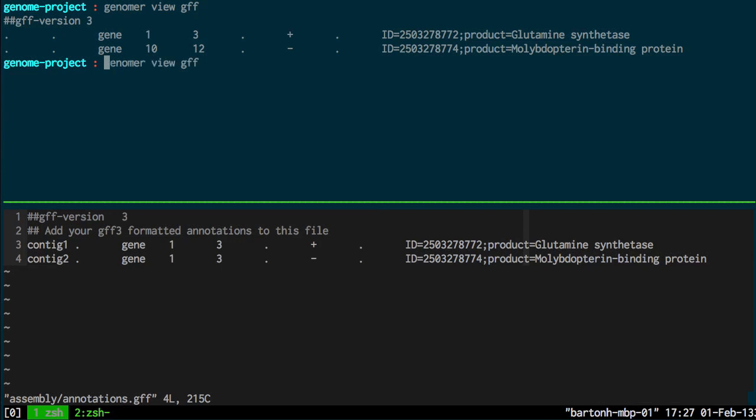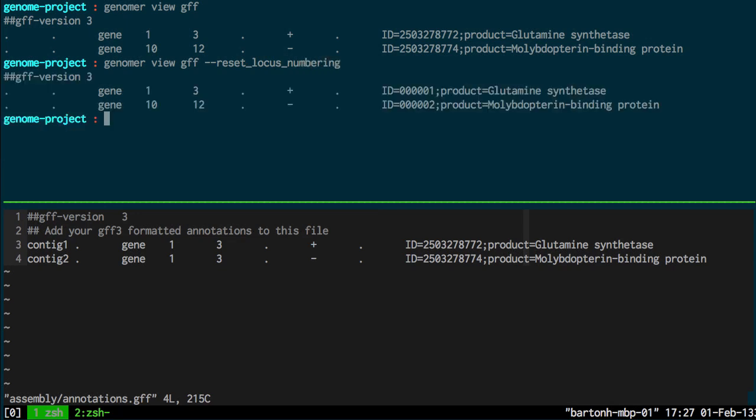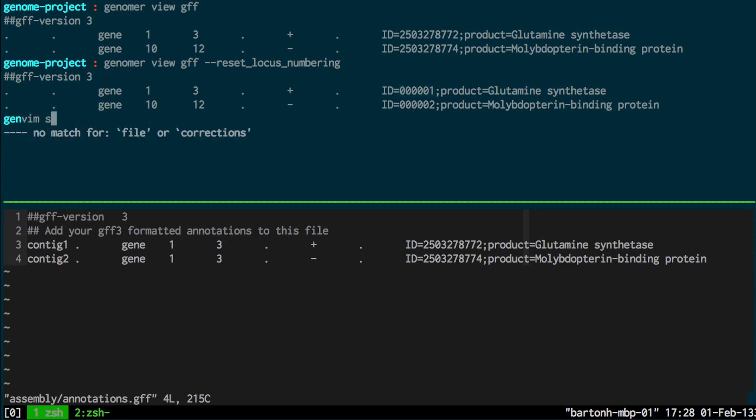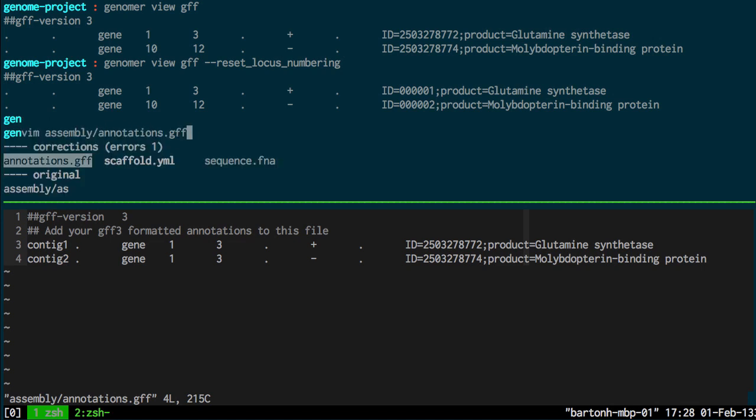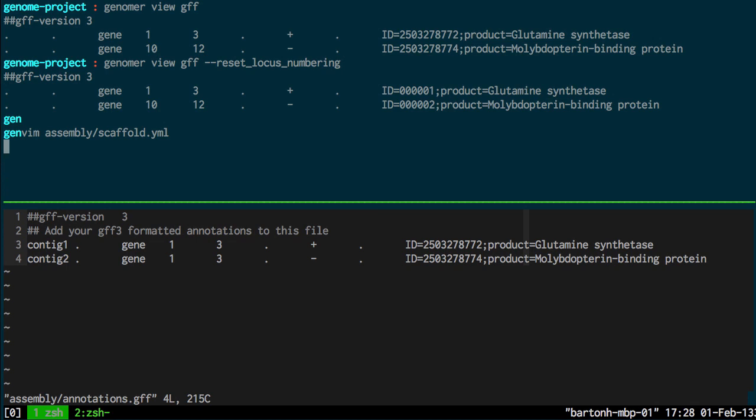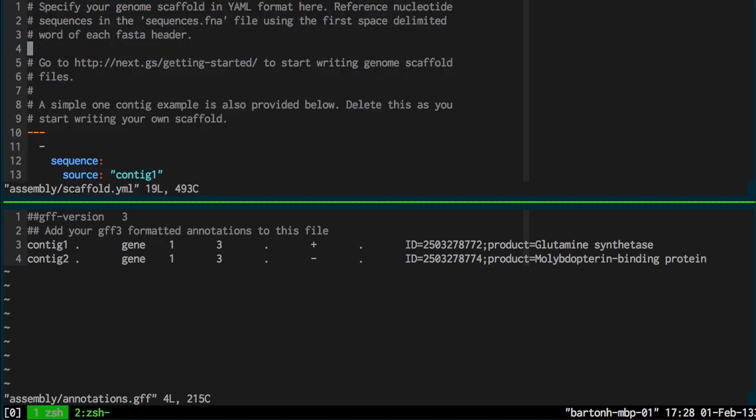And the Genoma view GFF command has an extra reset locus numbering option. So here now the ID is reset to the first annotation named one and the second annotation named two. And again, it maps to the scaffold.